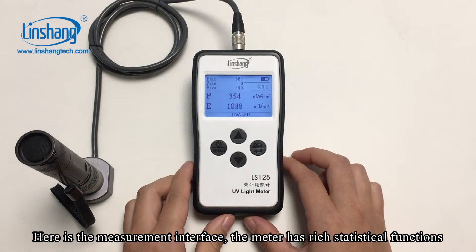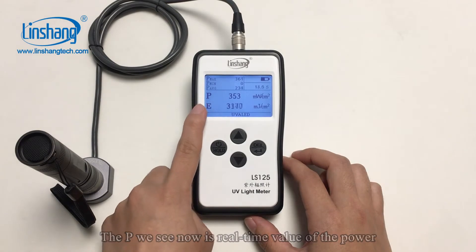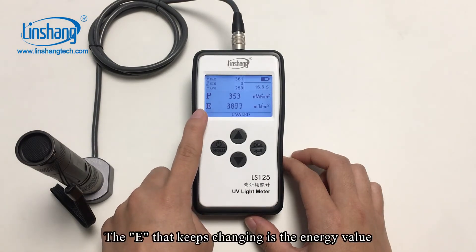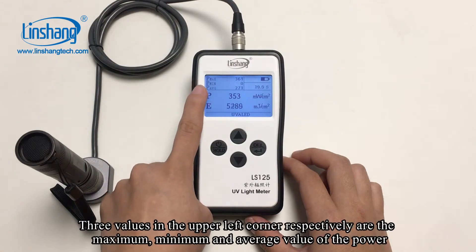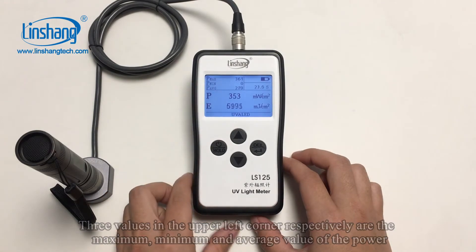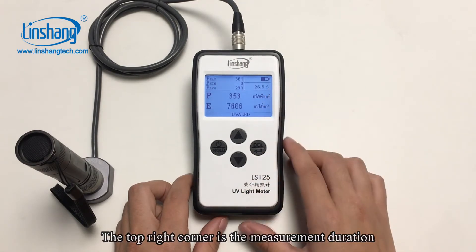Here is the measurement interface. The meter has rich statistic functions. P shows the real-time value of the power. The E that keeps changing is the energy value. The three values in the upper left corner are respectively the maximum, minimum, and average value of the power. The top right corner shows the measurement duration.